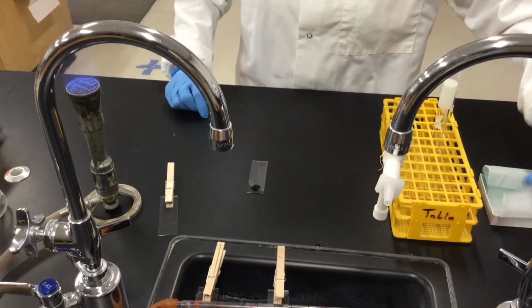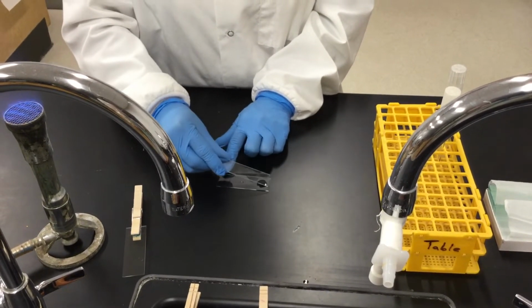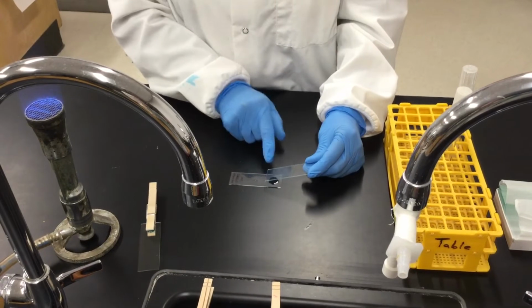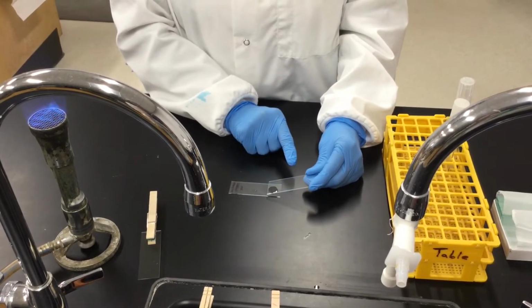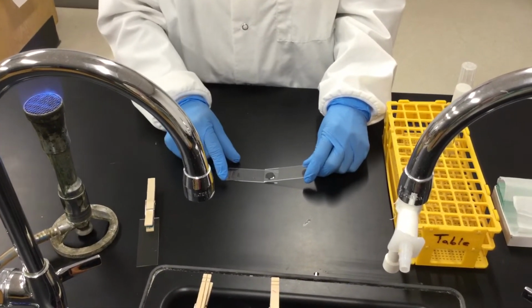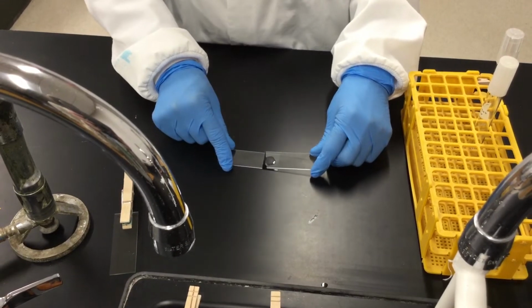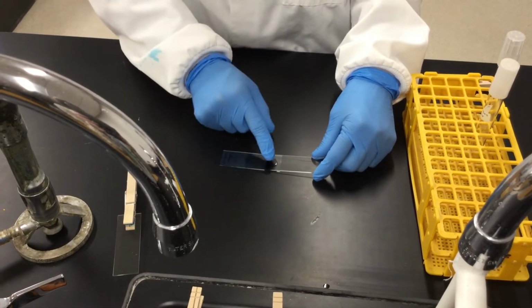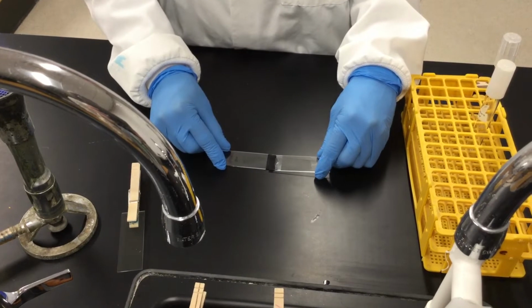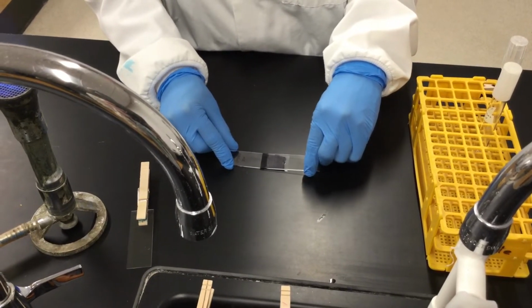And with another clean slide, you will put your slide almost at a 45-degree angle in this way, opposite to the end, like this, until by capillary action, and you kind of drop it a little bit till you grab on the edges, as you can see there, the stain. By capillary action, you will grab your dye in between the two slides, and then you will drag it like this a little bit towards the edge, and then on the opposite side like this.